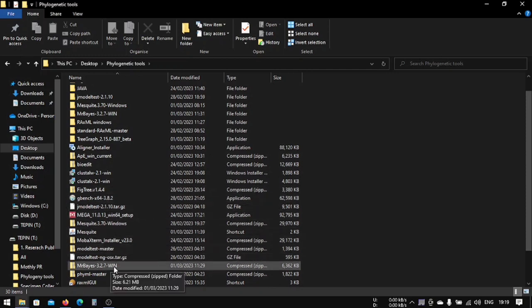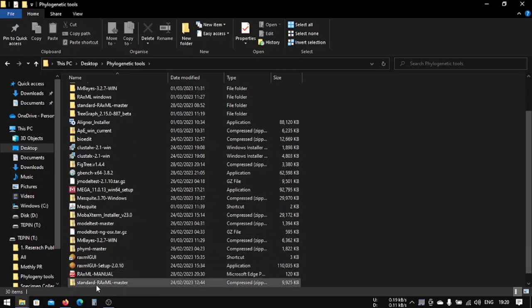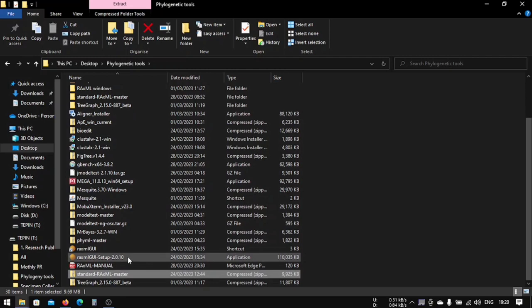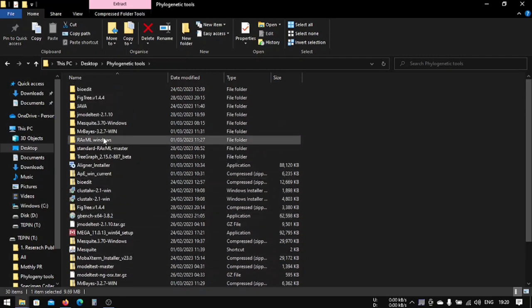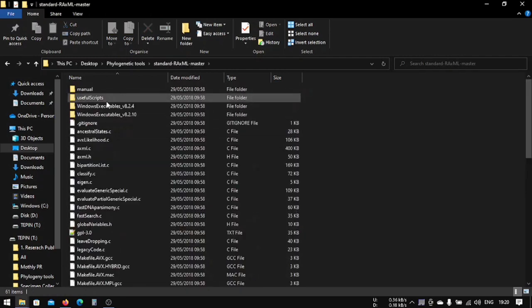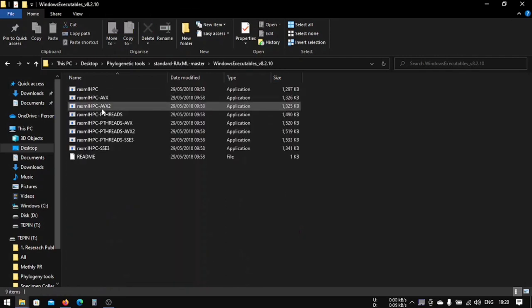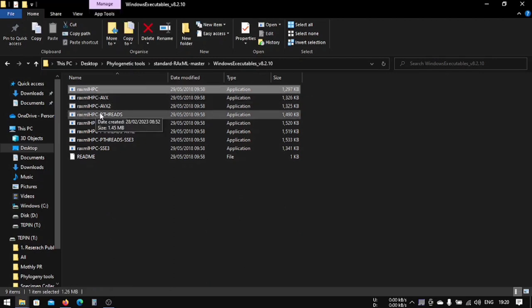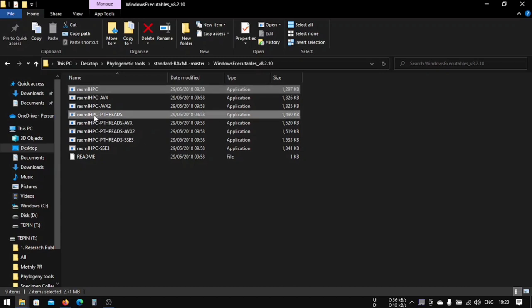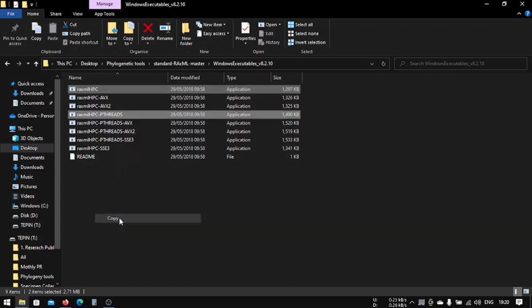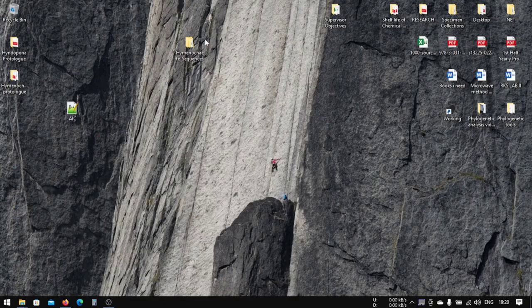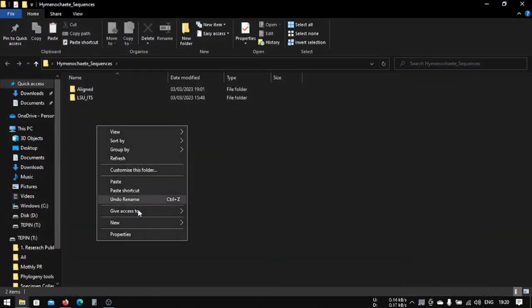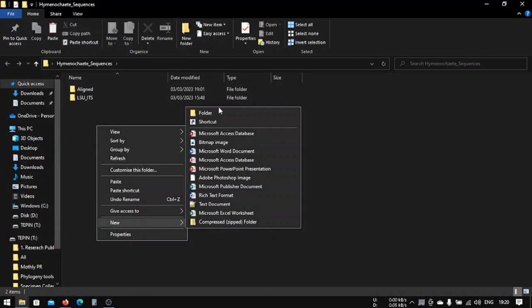This is the file we have to uncompress. After uncompressing, you will find these files here. We are only concerned with this. We'll take this RAxML HPC and pthreads. Just take this pthreads and HPC, copy it.